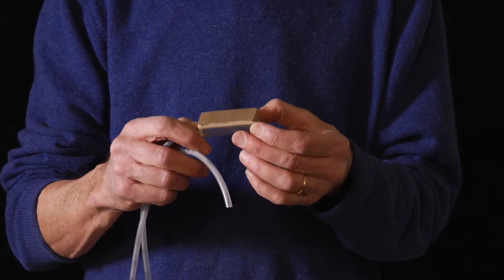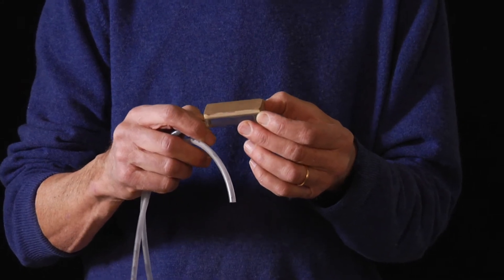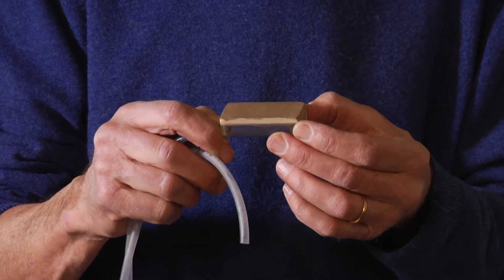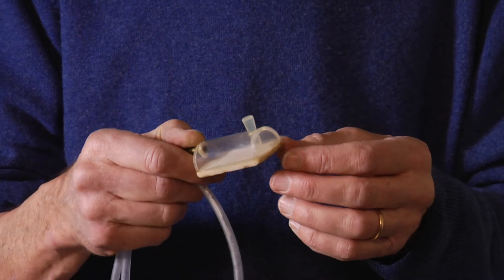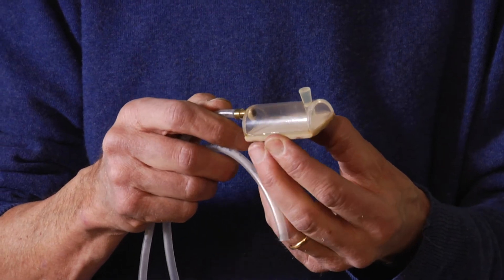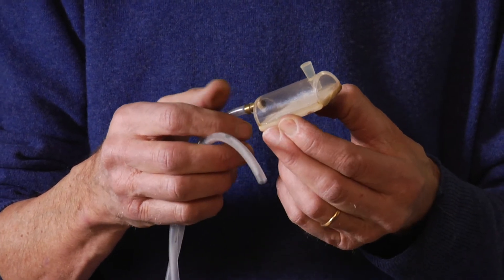We will now look in some detail at how water is retained in soils. For this, I have a little device here. It's a suction plate made by a ceramic material that is permeable to water, and we have attached a half cylinder of plexiglass to it and connected the plexiglass cylinder to a plastic tube.